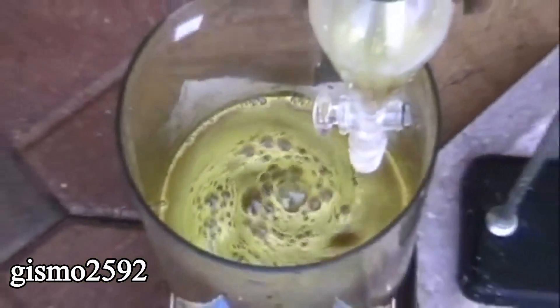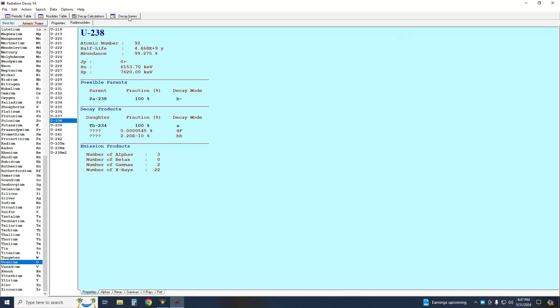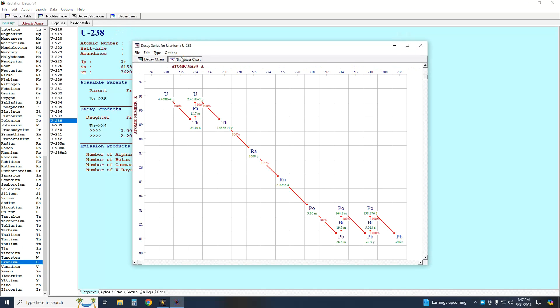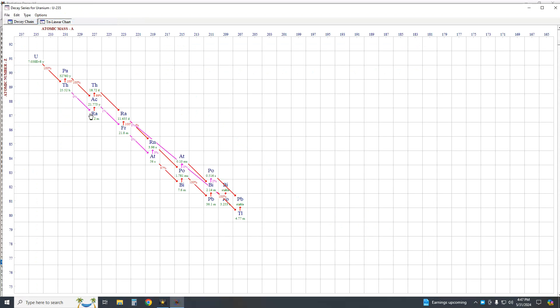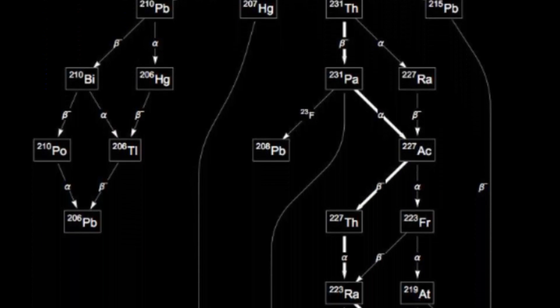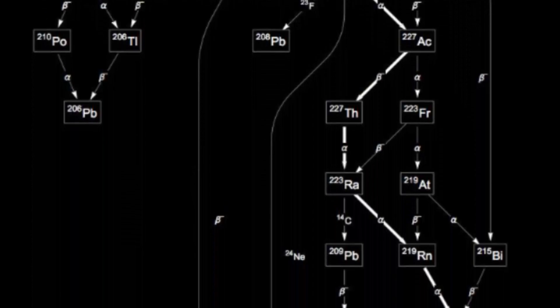In this video I want to take a look at the decay chain of both uranium-238 and uranium-235. Between the two there are no less than 24 isotopes from nine elements, including one gas. For that I'll use three methods of analysis, starting with the obvious gamma and x-ray spectroscopy.